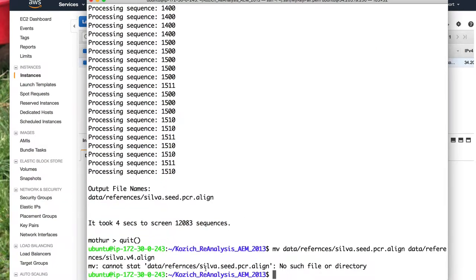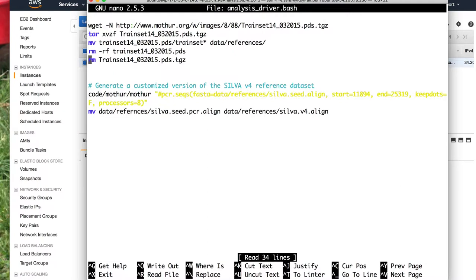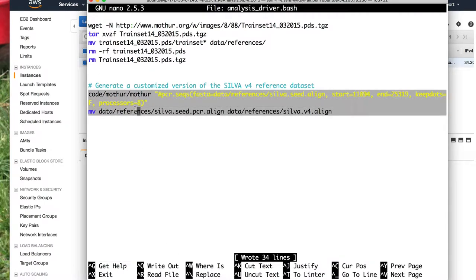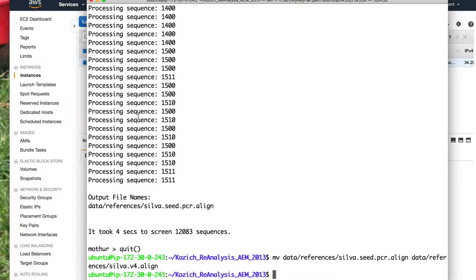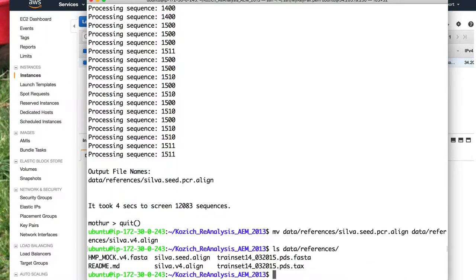It says 'cannot stat' — it can't find data/references/silva.seed.pcr.align, 'no such file or directory.' I misspelled 'references.' So let's go back into nano analysis_driver.bash and fix the spelling of references. Save that, copy and paste these lines back in, and hopefully we run this without any error messages. That works great. If we do ls data/references, we see that we have the silva.v4.align file.